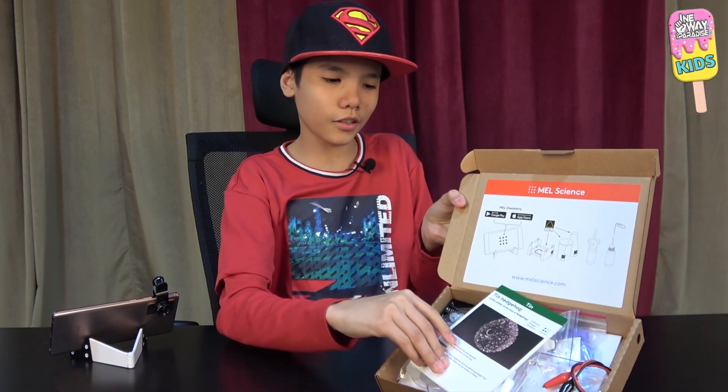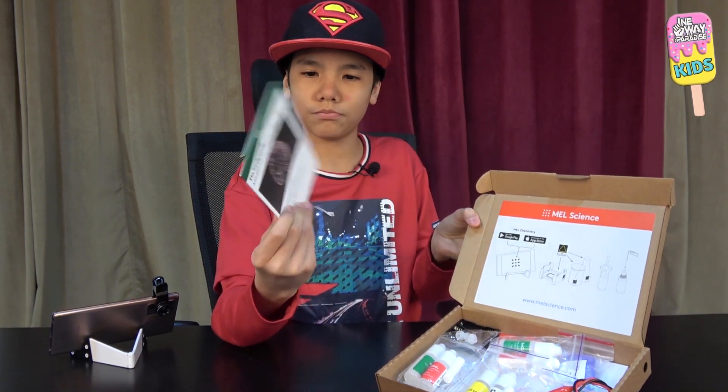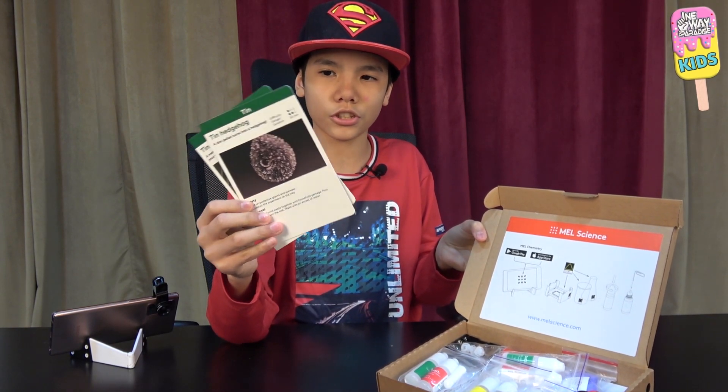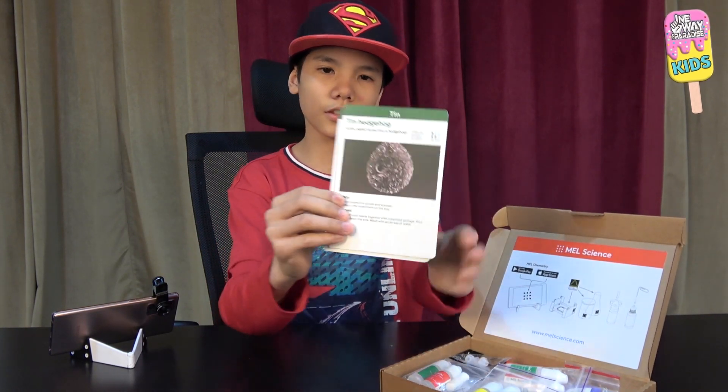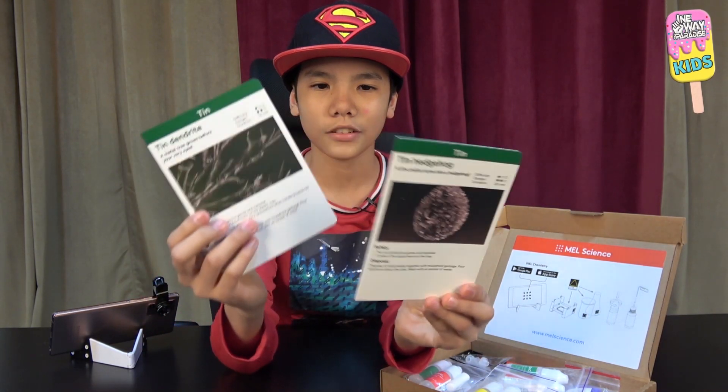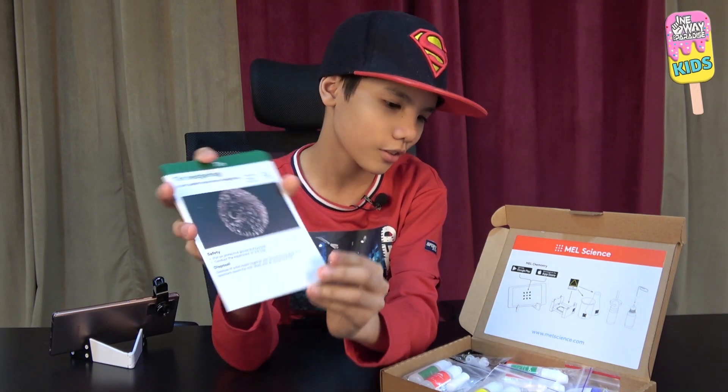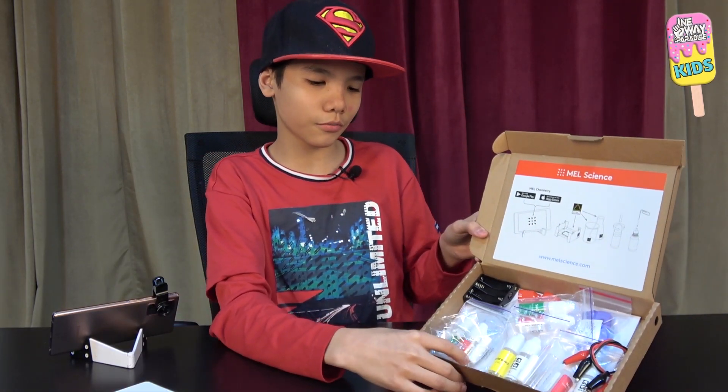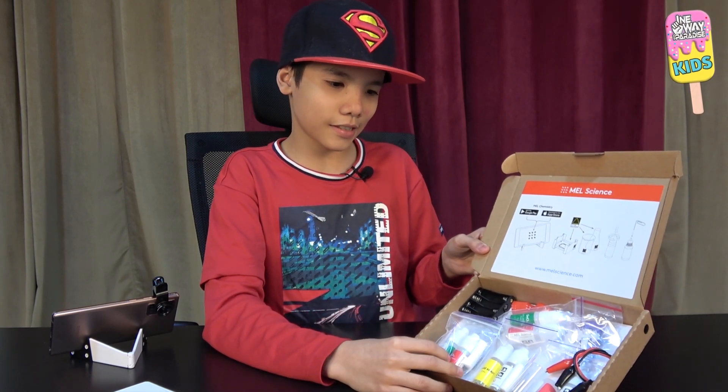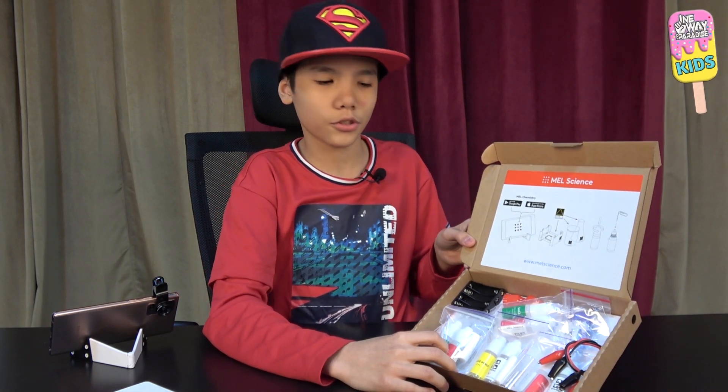These are two pamphlets of the different experiments or the instructions for the experiments. This is the tin hedgehog and this is the tin dendrite. We're going to be focusing on this one though. And here are the different materials that we need for the experiments. So without further ado let's switch the view and start the experiment.